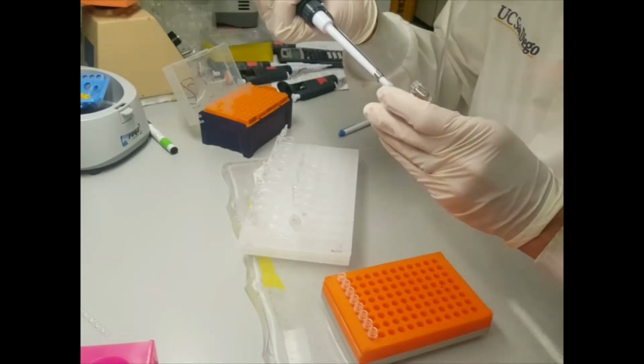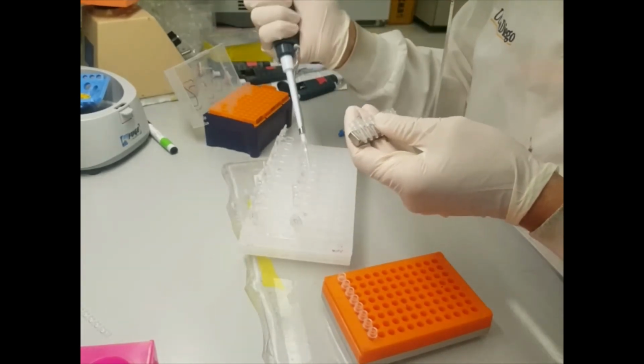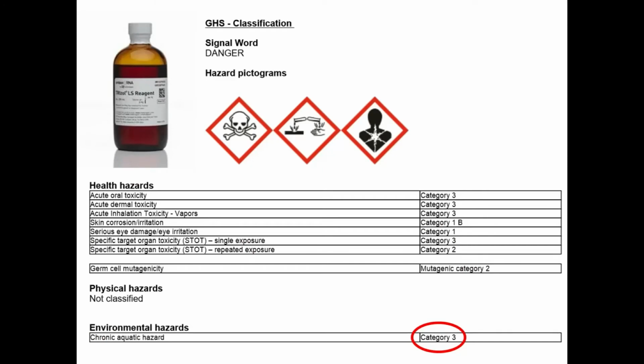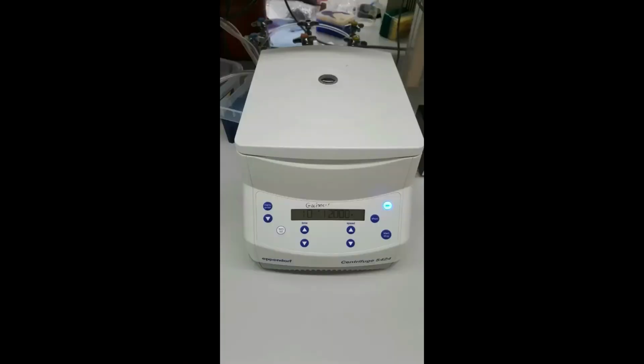Once all samples are transferred, move to the fume hood and add 500 microliters of TRIzol LS. Please read the SDS for TRIzol if you're not familiar with it. It's quite nasty stuff. After adding the TRIzol LS, cap the tubes, vortex well and quick spin. Next, add about 150 microliters of chloroform to trigger the phase separation. Again, vortex the samples extremely well, and then some more, and then spin them at room temperature at about 12,000 g for 10 minutes. You could also spin them at 4 degrees, however, you may sometimes see the proteins accumulate in the interface.